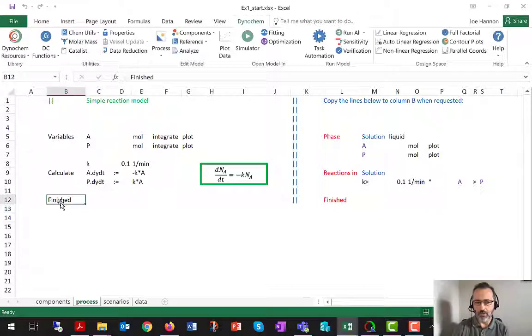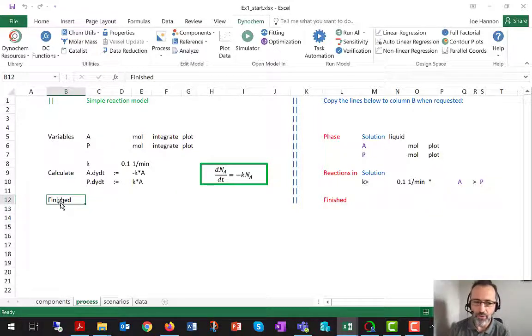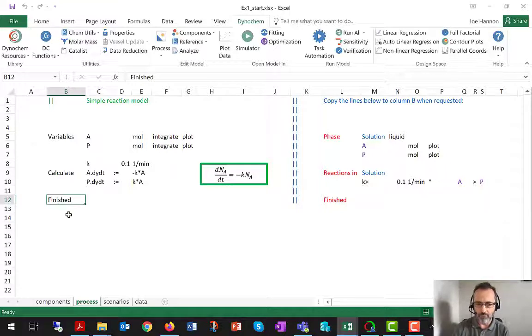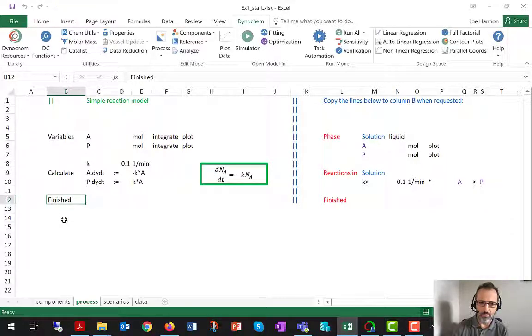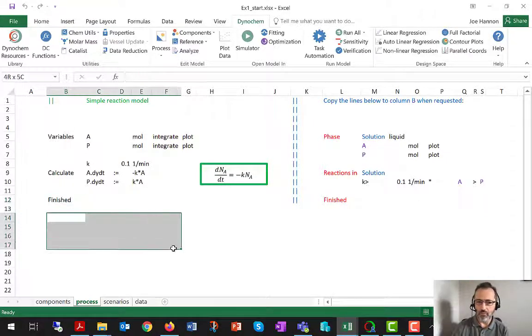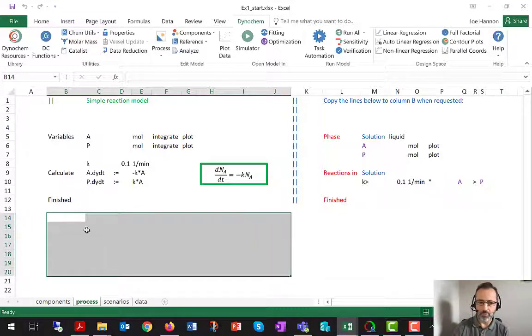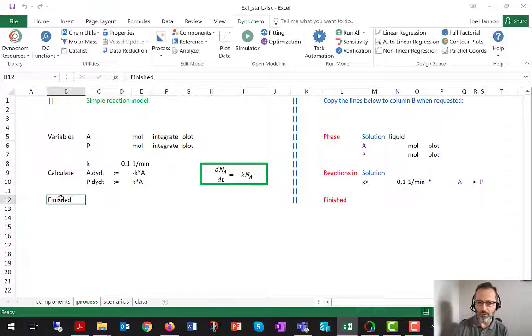Finished is here. I should tell power users, finished is optional, but very useful for properly delineating the bottom of your model, because you might have all kinds of other content below finished that you don't want the software to read.